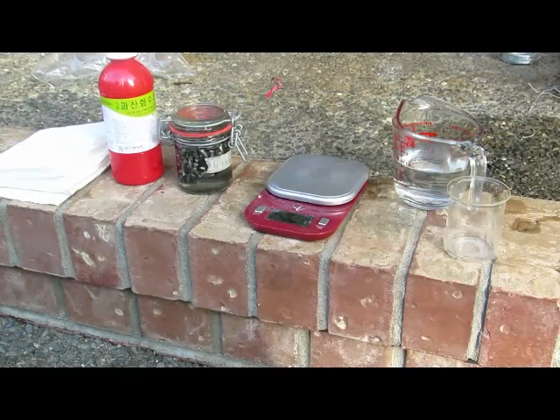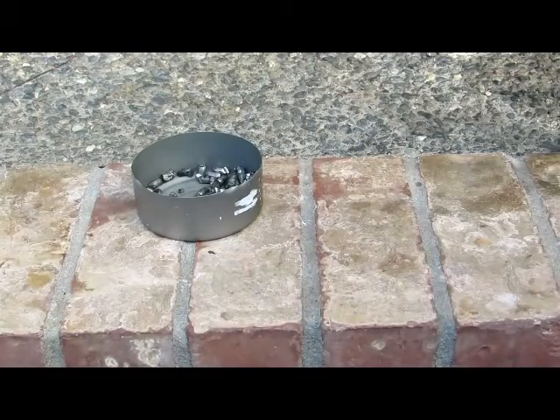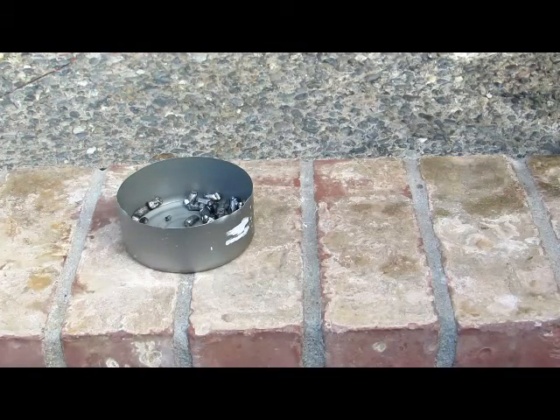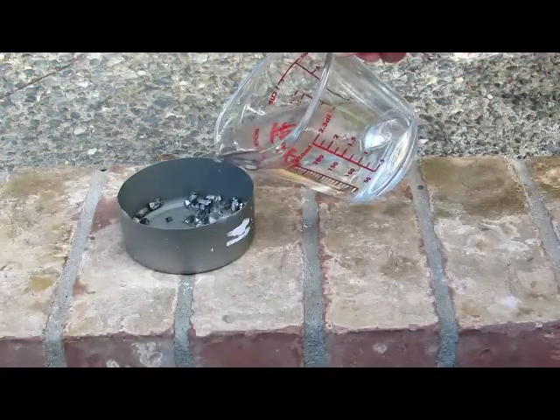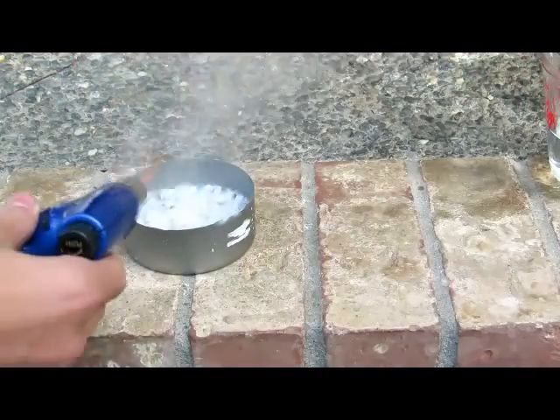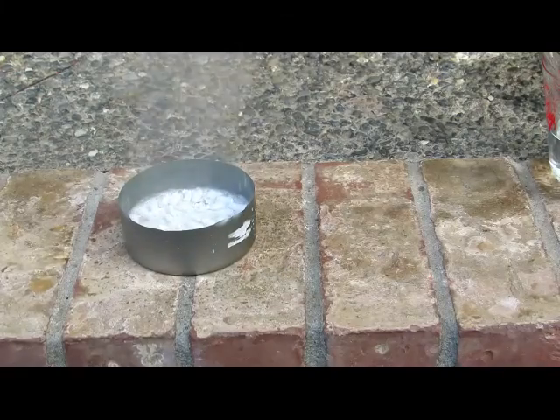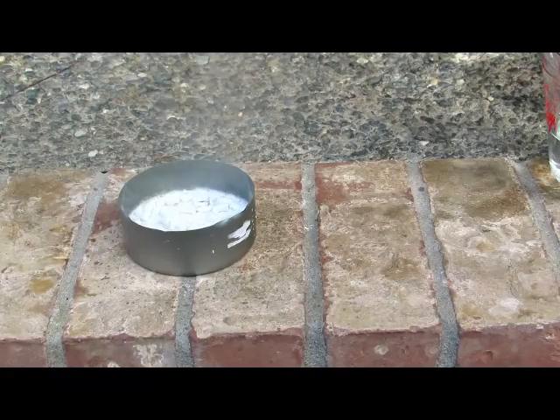First we're going to weigh out about 5 grams of our lithium metal. Make sure you dry off any mineral oil if it's stored under mineral oil. We actually used 4 grams of lithium instead of 5, because as you can see it's quite a bit of metal and we don't want to use it all. We're going to add some normal distilled water to it. You can see a violent reaction occurs and it produces large amounts of hydrogen gas, though for some reason it's not flaming.